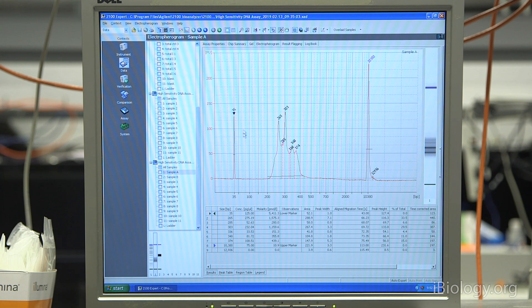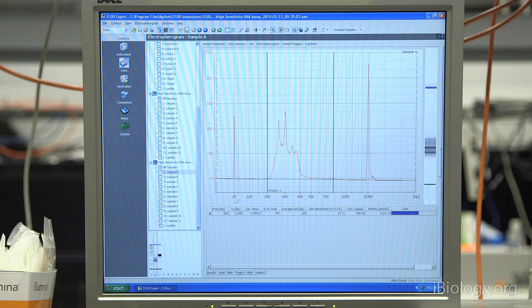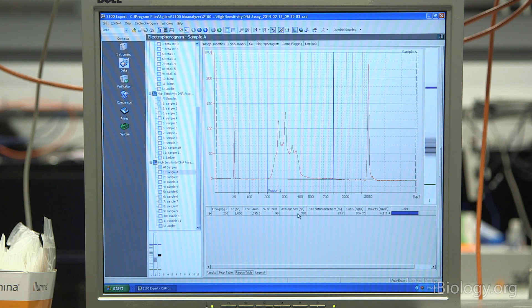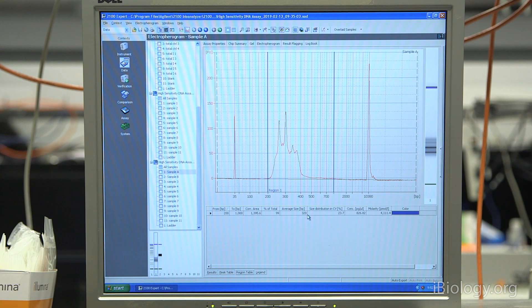Down here on the electropherogram, there are a couple of things you can do. You can set something called a region table. For next-gen sequencing libraries, you typically set these around 200 base pairs up to 1 KB. That's displayed here. What this will do is it'll analyze only the material that shows up within this range. This will give you a rough concentration in picomoles. This is a little over 4,000 picomolar concentration, or roughly 4 nanomolars. It'll also give you an average size, which is useful for some downstream QC steps. This library has an average size of 320 base pairs.